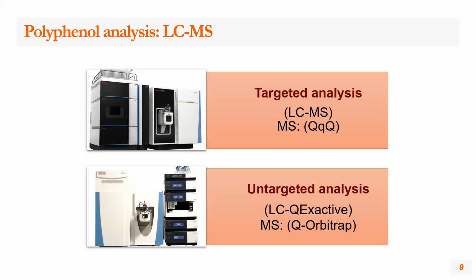Or we can use the same tool for identification. So we have unknown compounds, and we can inject our sample on this tool. It will give us some charts or figures, and we need to work on that to put the puzzle pieces together to understand what the main molecule is, what's there.